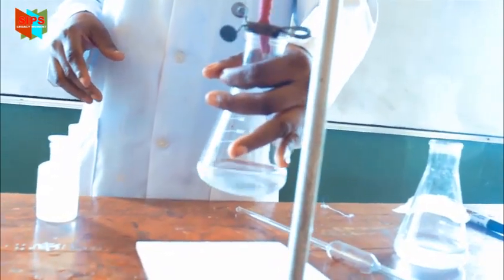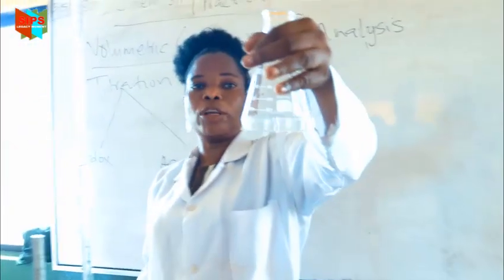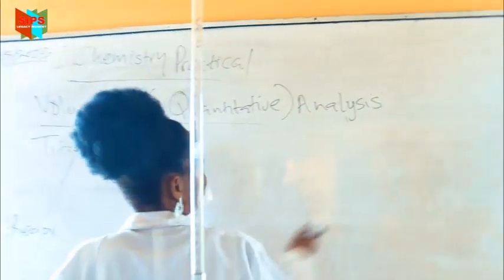So at this stage, I have titrated. I'm at the end point now. You can see that the pink color has disappeared to colorless. So what I'm going to do is take the burette reading.